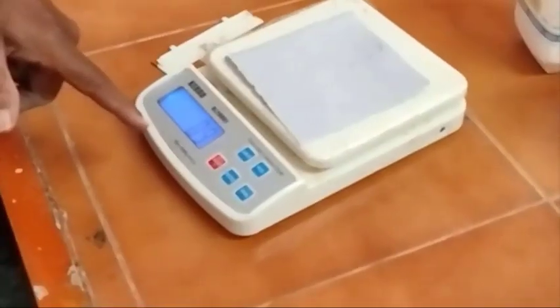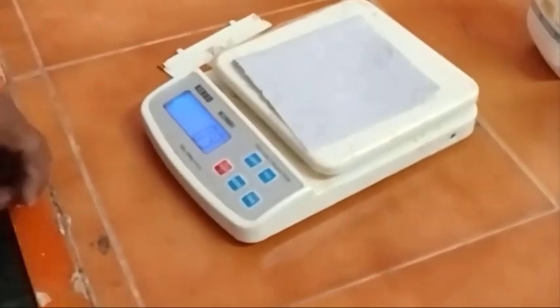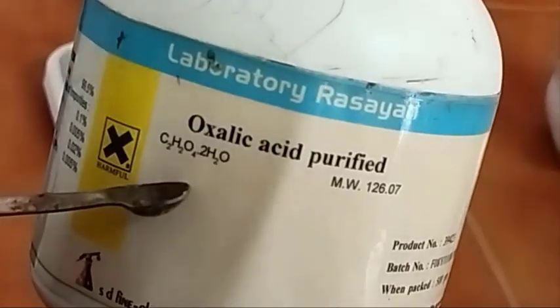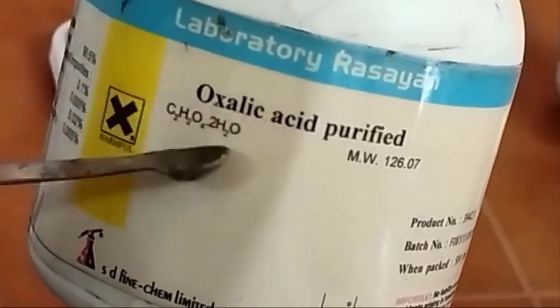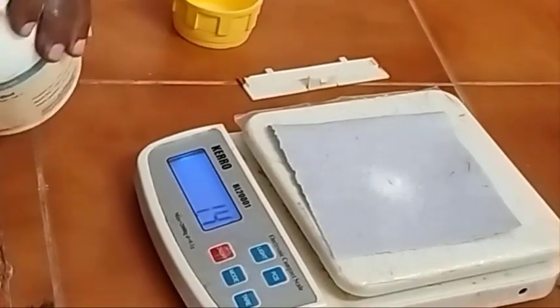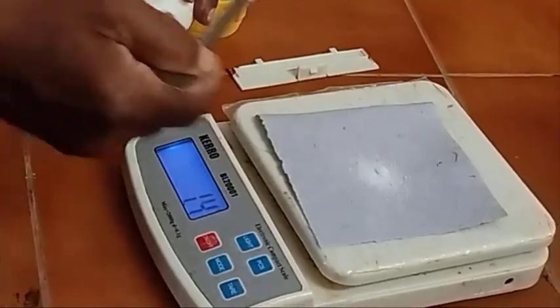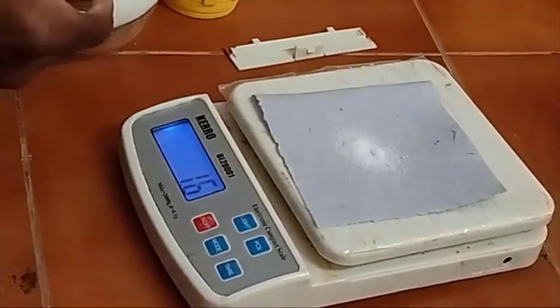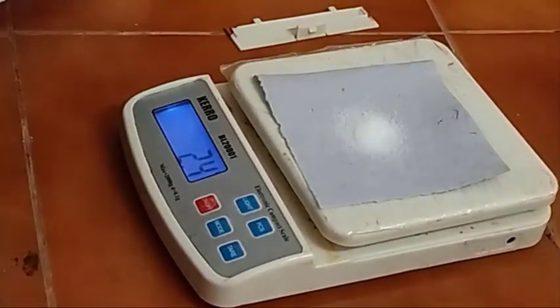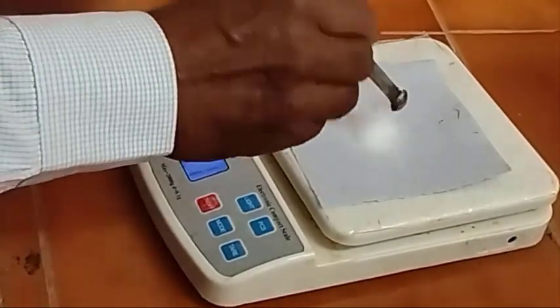Now the weight of the paper is approximately 0.9 grams. This is oxalic acid, C2H2O4·2H2O, molar mass 126 grams. Now while seeing the reading, take out the oxalic acid. So how much weight do you have to take? 6.3 grams for preparing 0.05 molar 1 liter solution.